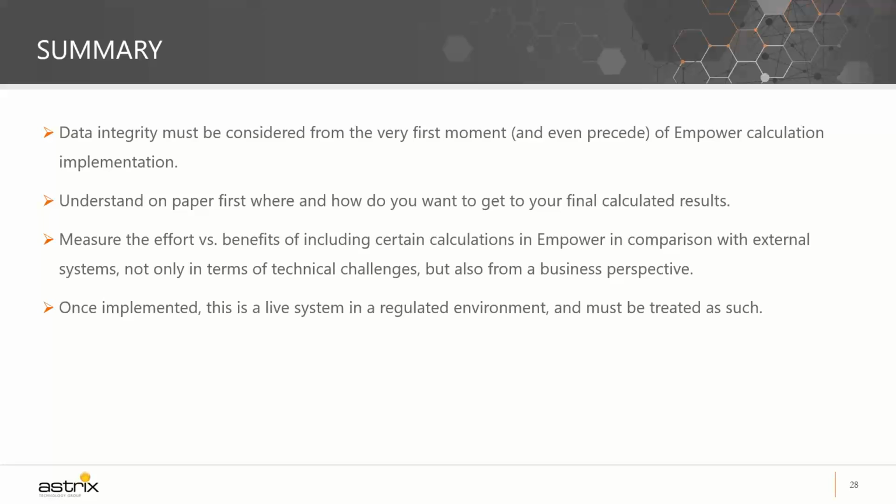And even though it's easy to do a pass and fail custom field, imagine having to build multiple pass and fail formulas for all your evaluations, like resolution, USP tailing, percent over label claim, or percent agreement. It can potentially double the number of custom fields you're creating for a specific test method. So that consumes time of development, validation, and so on.